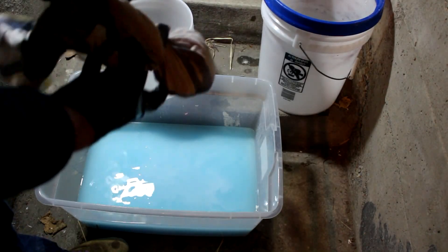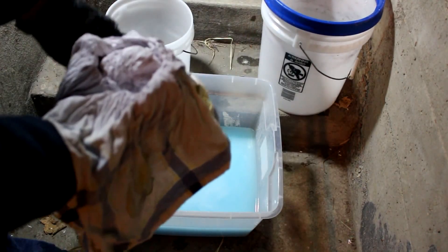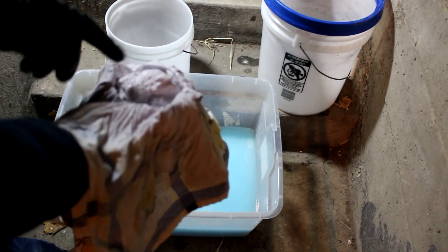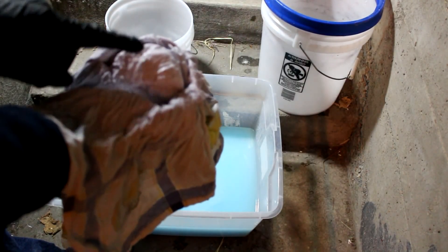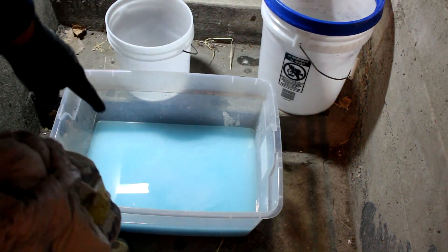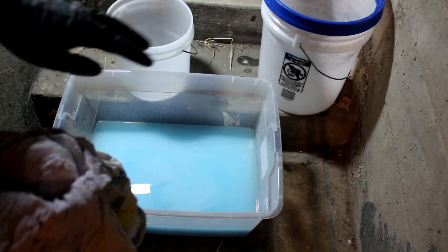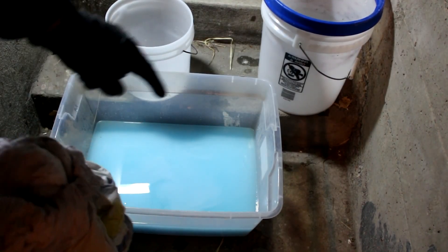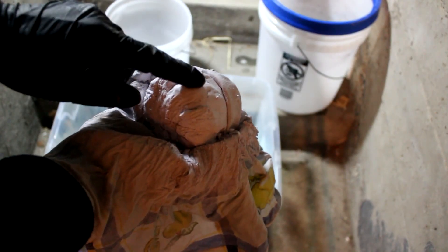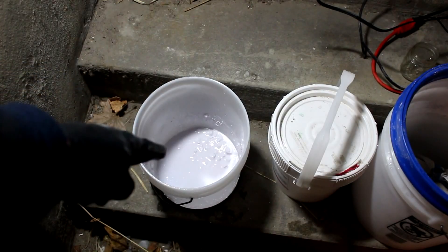I've squeezed the silver chloride through a cloth, which retained most of the silver and drove out as much water as I could. Some silver chloride did go through the cloth and is back in the solution, but it should settle out and I'll recollect it. I definitely have 90% of it right here. Now that I've got the copper washed out of the silver, I'm going to convert the silver into silver oxide using potassium hydroxide.